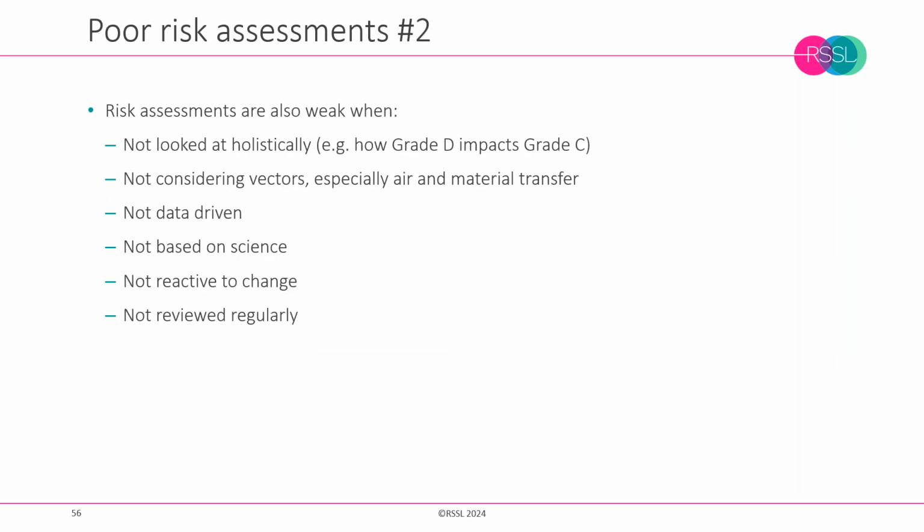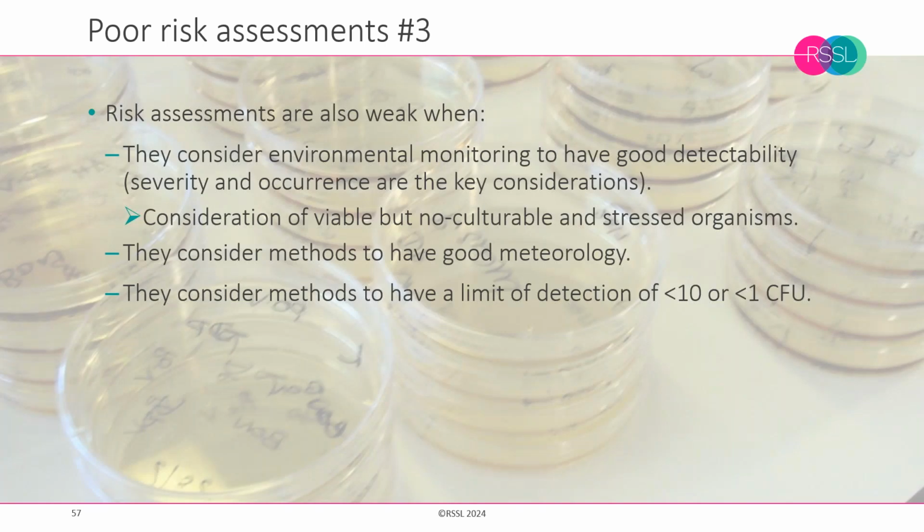So just some general advice is always to think holistically, think how areas are connected together, and to be driven by our data to actually understand what is going on. And also to understand that the environmental monitoring methods are weak, therefore we need a lot of data, and we need trends over time before we should embark on these types of practices.